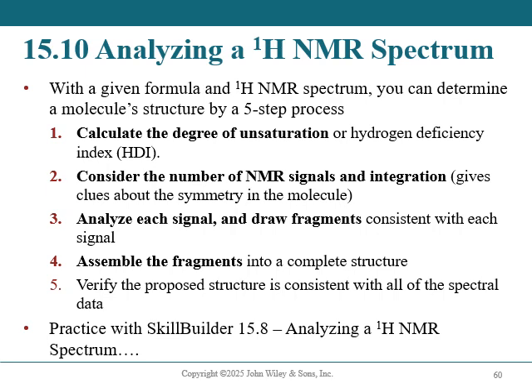Typically, NMR by itself is enough for us to identify a molecule, although we usually use it in conjunction with IR, so that one technique corroborates the information from the other. It's a really good way to have a very reliable conclusion.